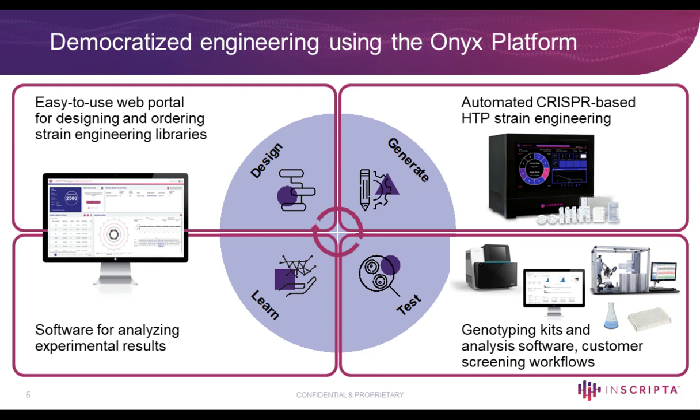The instrument runs, and then you're able to get out a single tube that contains your edited cell population. Then you can take that tube and go do your experiments. You can do your selection experiments and all sorts of downstream phenotypic-based experiments, and then come back and use sequencing to track those barcodes or the edits on the genome.